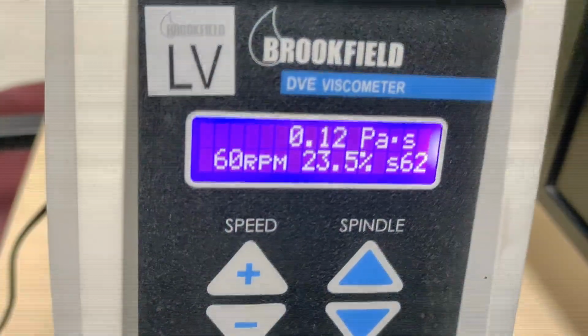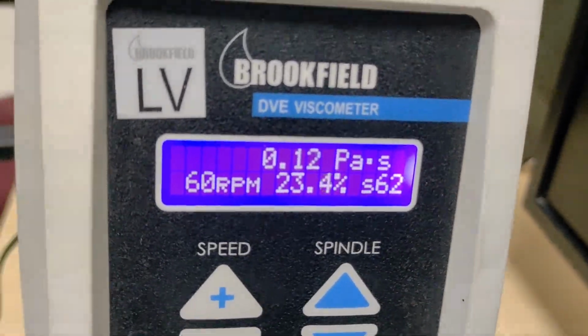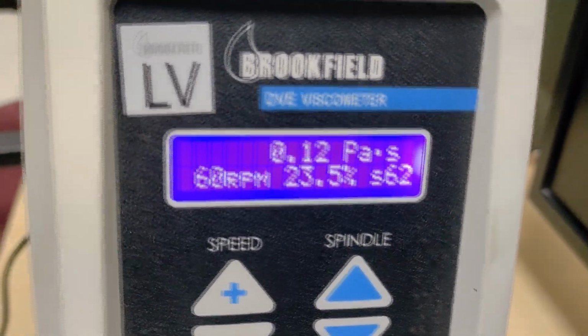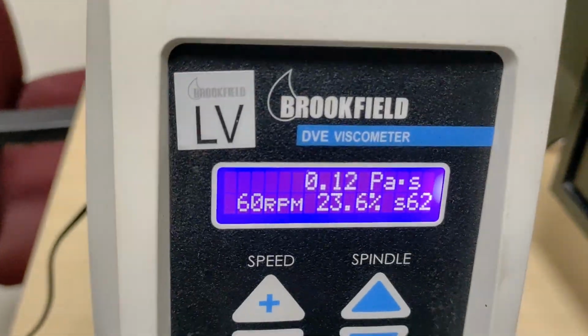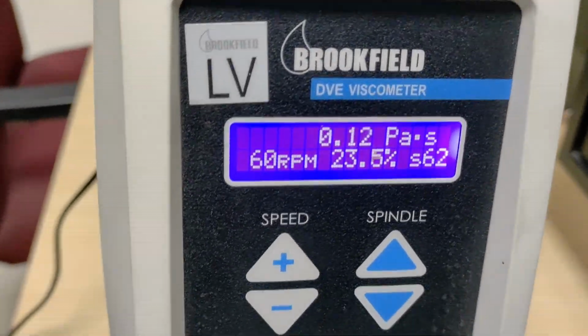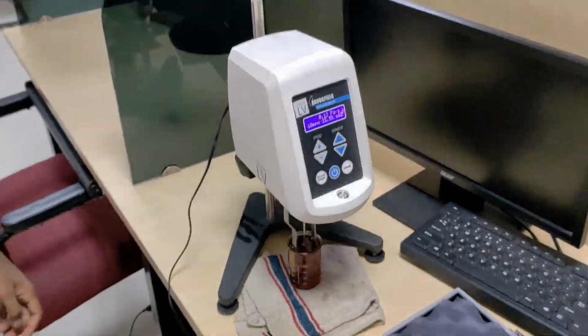So we take different RPMs and different torque rates in the tabular column with the same viscosity value. Calculate the experimental viscosity values using the formulas given in the lab manual and see if it matches with the displayed viscosity. This is the Brookfield Viscometer experiment. We can conduct this experiment with different spindles and different torque levels above 11%, and also with different RPMs, and hence after the calculation we get the same values of the viscosity.